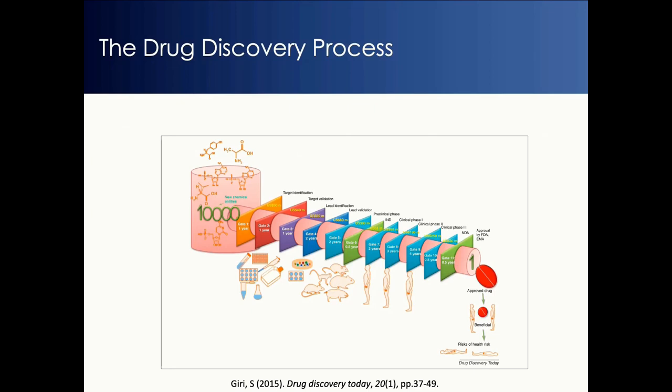The drug discovery process, as many of you are aware, is really long and complex and expensive. Particularly, the first years of the drug discovery process rely heavily on the use of in vitro assays that more commonly use cell lines and cell technology assays to do the initial characterization of compounds. Specifically, let me show you what we do there.